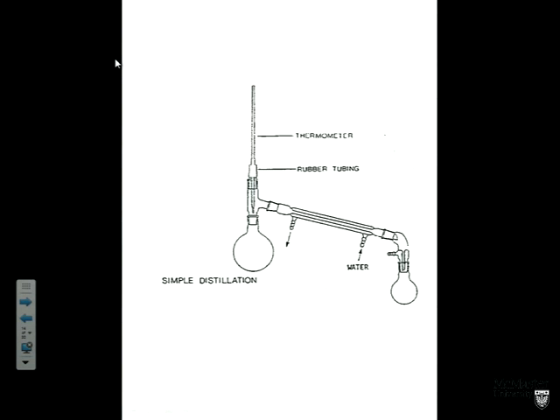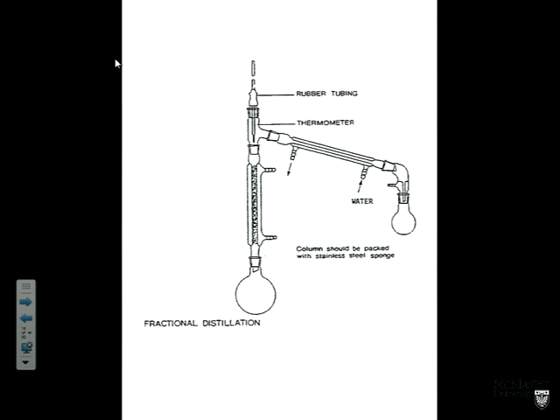The vapor then travels through a condenser and we collect the product on the right-hand side. And this, of course, distillation is a technique that's as old as the hills. People have been distilling ethanol for reasons that I couldn't begin to imagine out of fermentation products for centuries, if not millennia. Right? So this is all fairly familiar.